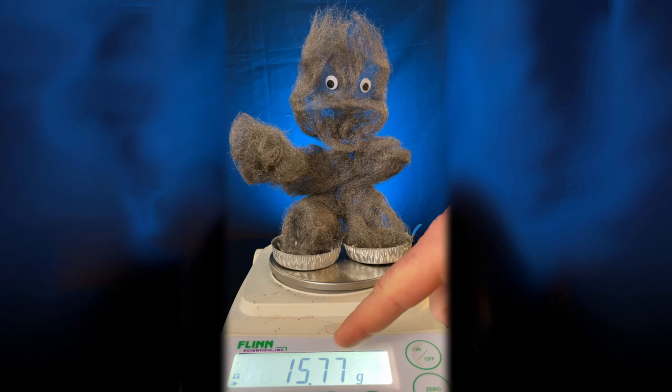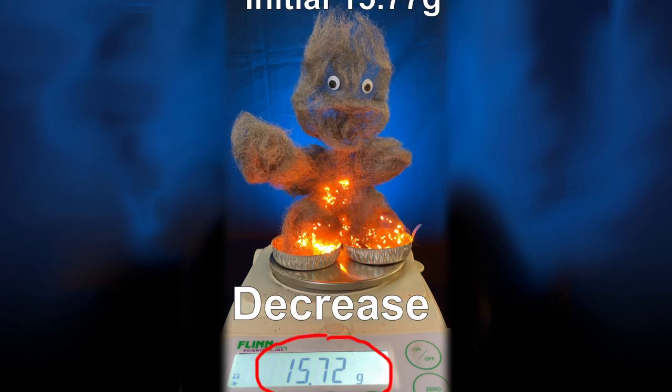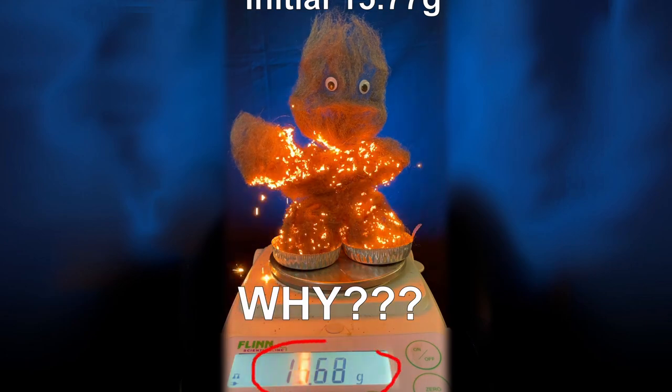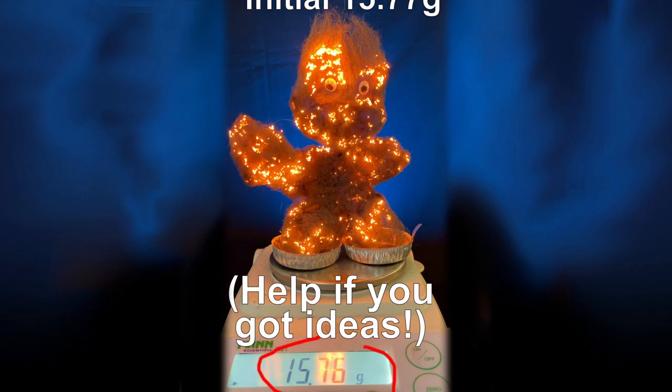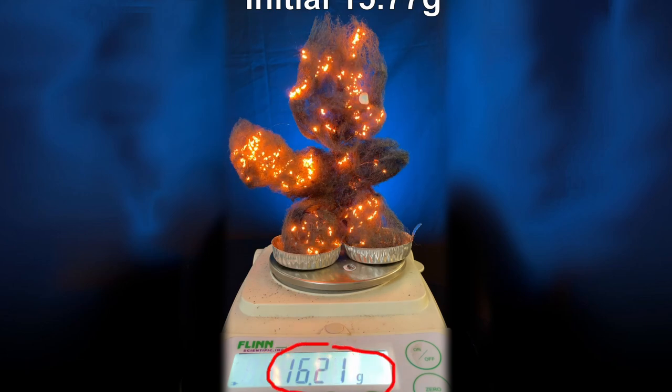Steel wool boy is a totally different story. Watch the mass — this is visually one of my favorite experiments. At the beginning, the mass decreases and I don't know why. If you know, jot me a quick note in the comments. Notice the mass starts to go up and up and up even though steel wool boy is burning.